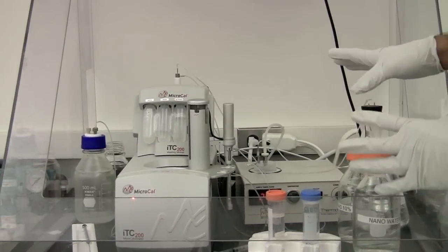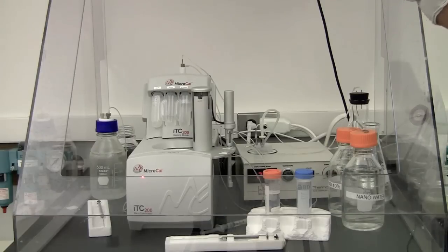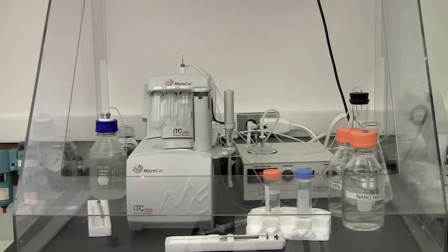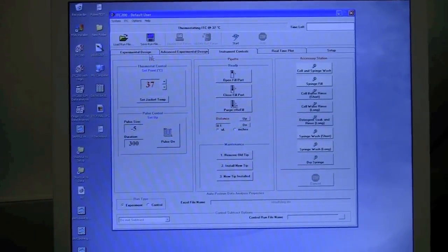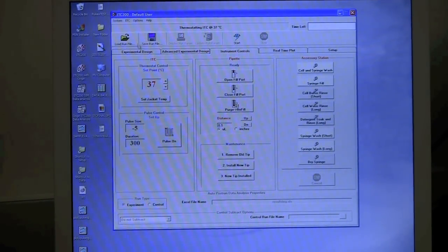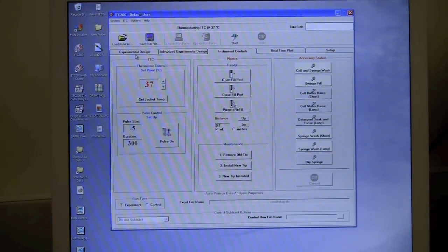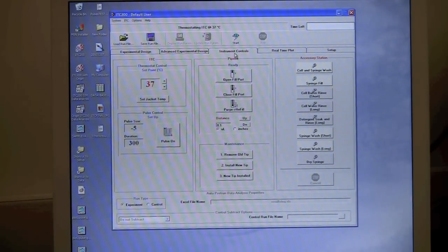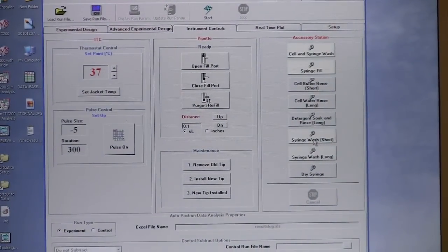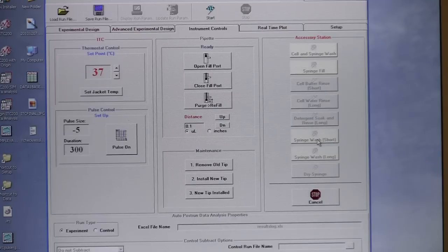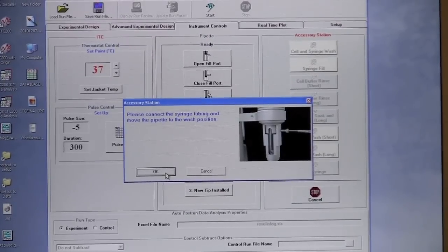First, you will find the syringe in this position and we have to wash it. The commands are controlled by the monitor, so you go to the monitor and open the software — it's on the desktop as ITC 200. Go to Instrument Controls, click that, and you will find different commands. Look for Syringe Wash, click that, and it will ask you to connect the syringe.